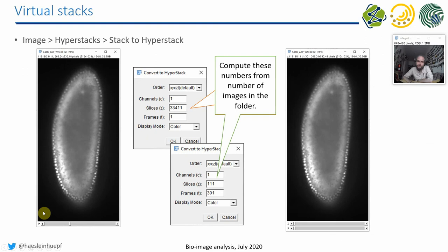What you should do, depending on how your data is shaped, is use the menu called Image HyperStacks Stack to HyperStack to convert the originally loaded stack. It looks like a three-dimensional dataset because you see a single bar here on the bottom.